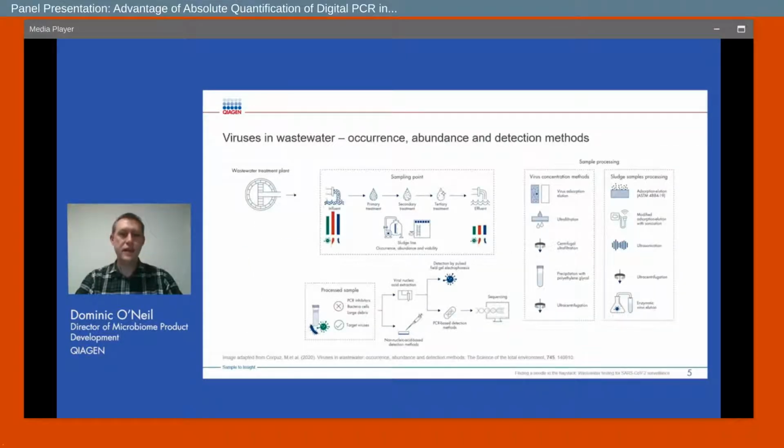So detection of viruses in wastewater has been known for quite some time, in particular for poliovirus, for example, and those techniques are adaptable very easily to SARS-CoV-2 detection. It's known that SARS-CoV-2 passes through the intestinal tract and is shed into the wastewater, and therefore testing wastewater with the associated fecal matter will pick up SARS-CoV-2 viral RNA if it's present from infected individuals in the catchment.